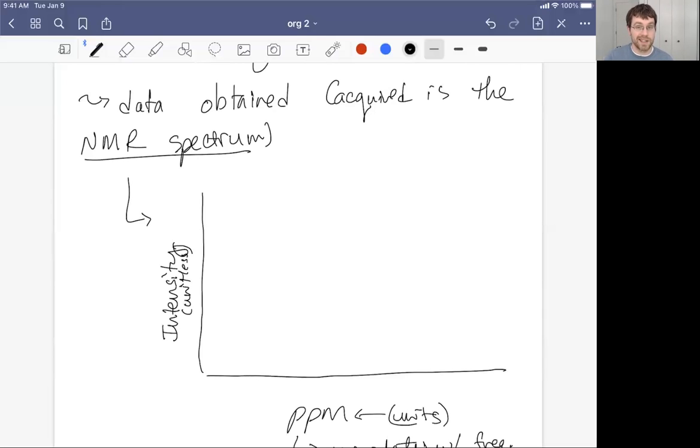And what we would see is kind of like what we had been looking at in our examples. You have some peaks. They're going to look a little bit different than this, but we see these peaks. And these peaks just have what are called ppm values, which is the unit for the peak, as opposed to a more formal value for the frequency.